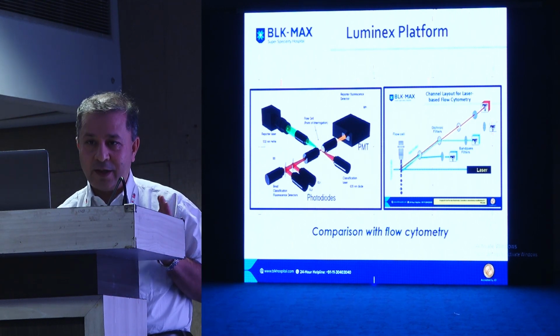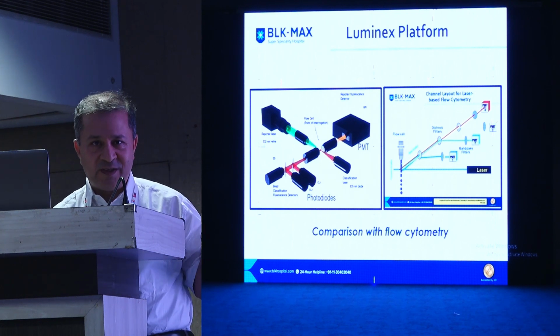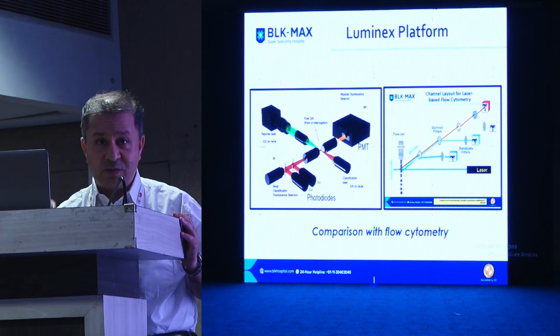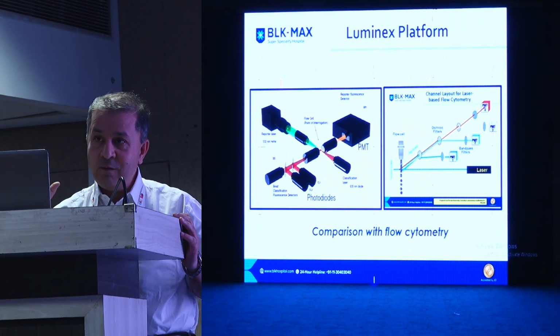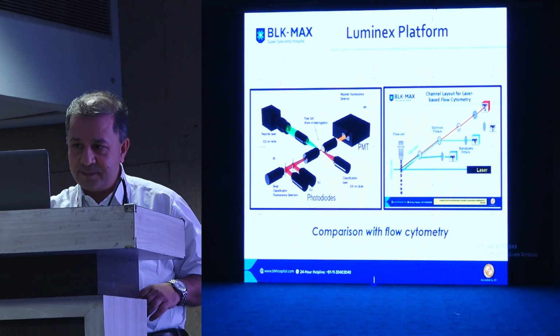So what am I trying to say? If you don't have a Luminex, don't worry, don't be envious or jealous. If you have a flow cytometer in your system, because many hematology centers will have it, you can use flow cytometry for doing what you want to do in transplant immunology exactly the same way, and I'll show you that in my subsequent slides.